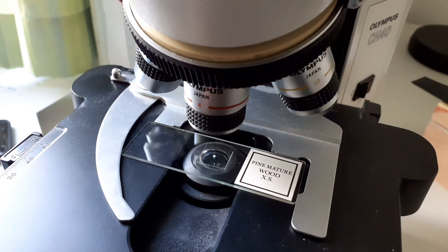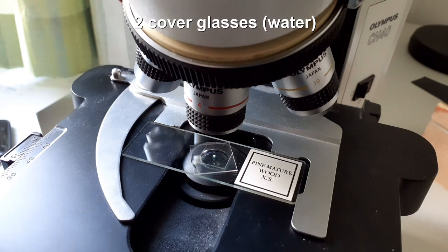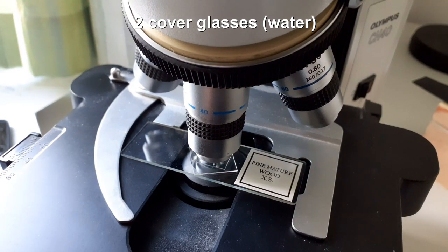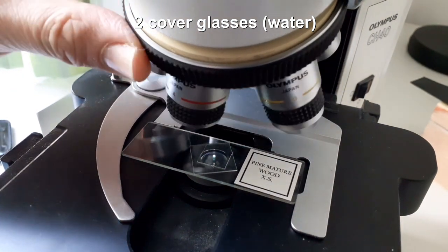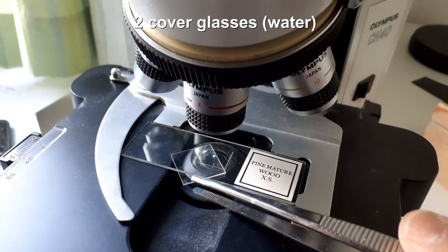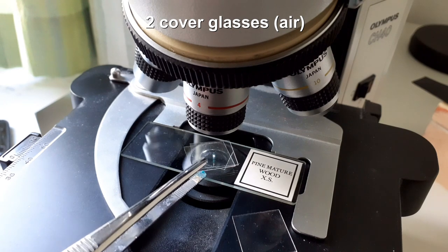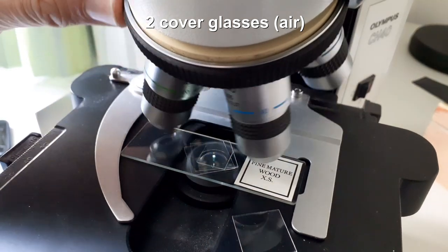I'll be taking three pictures. The first one is just the permanent mount which already has only one cover glass. Then I'll be adding two cover glasses stuck together by water, which is almost like using one very thick cover glass. I rotate the 40x objective in place, and to exchange the cover glass I rotate back to the 4x objective. The last picture is where I add two cover glasses separated by air.